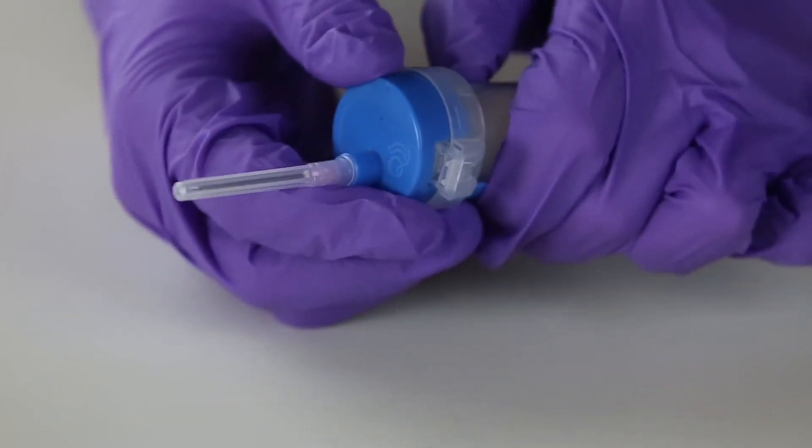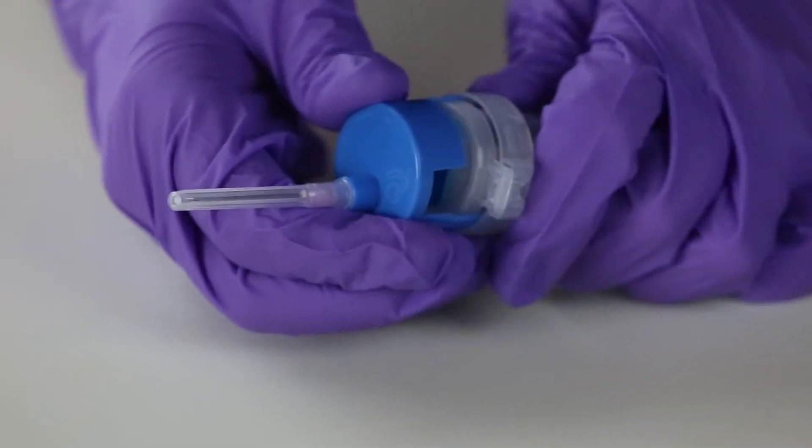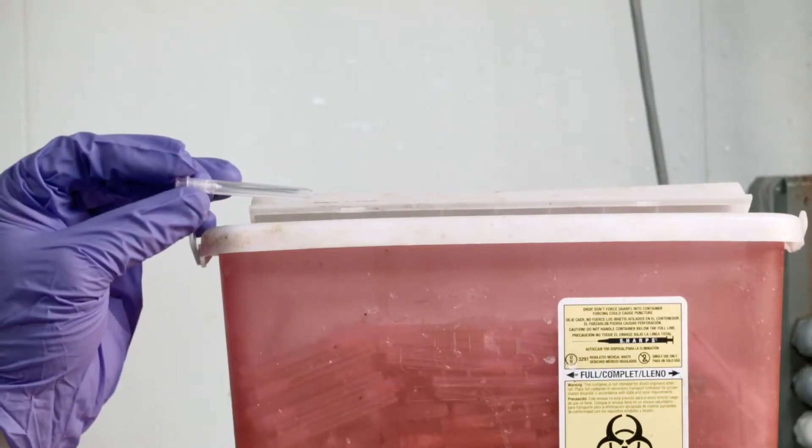Firmly pull the cap and remove it from the TrueDraw Single Sampler. Remove the needle and discard in a sharps container. Place the cap in a trash container.